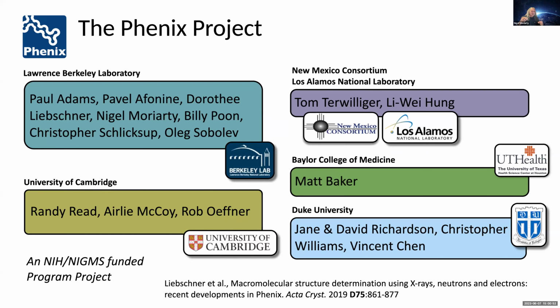So I'm asserting to the user that if they've put something other than protons into the model, they believe it's there. This little module that I just spoke about doesn't look at the density specifically. So I have to rely on the user saying, okay, this water molecule is here, I see a density blob for it, it's got to be there at least most of the time. So yeah, there's no partial occupancy.